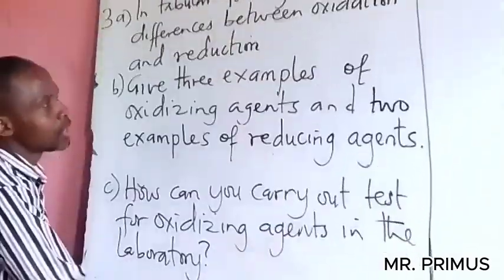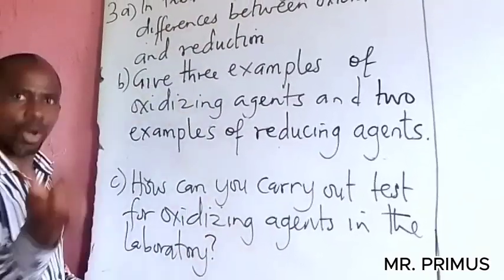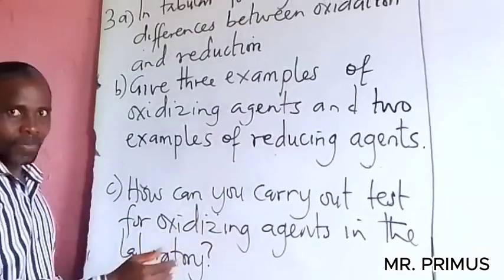We are going to answer all these questions. At the end of this lesson, we'll answer all these questions. And there's a way I want to start it. Let's focus on this. Look at this.